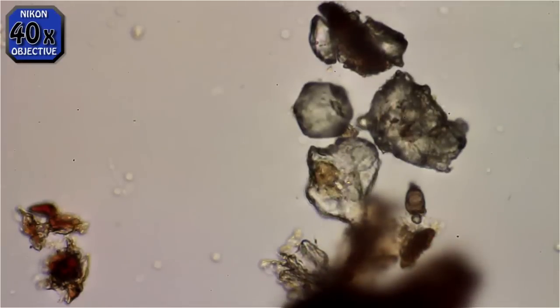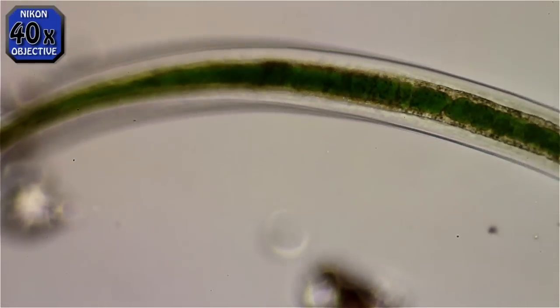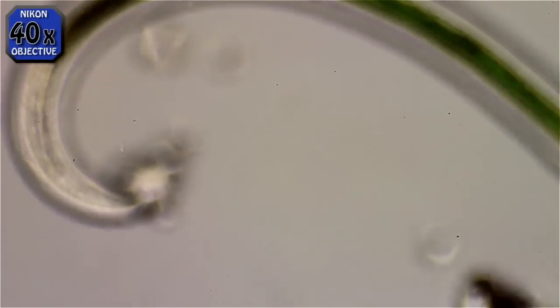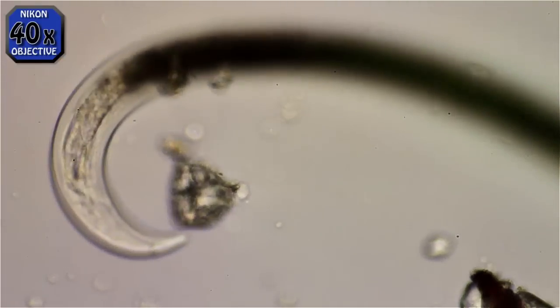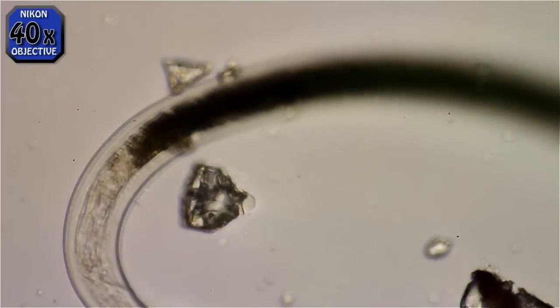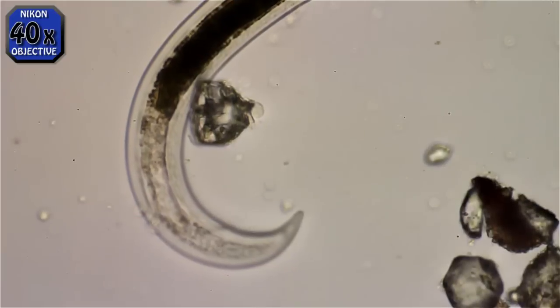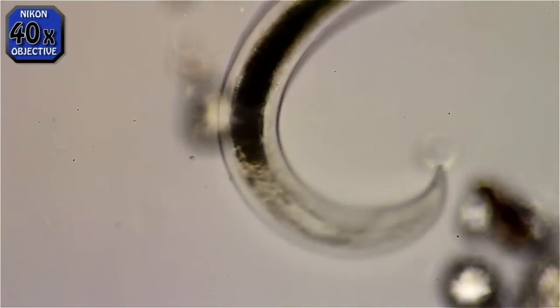This is a multicellular animal, by the way. I'm using a 40x objective. You can see the anal line on the inside of the hook — it goes in and out of focus, but you can see it.